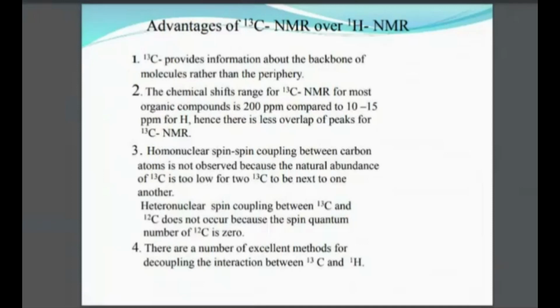So when I say overlap is rare, what factor of the graph has increased? Anybody? Can you guess the word? If there is no overlap, what is better? You can consider this with your HPLC signals. Yes, Pratiksha, brilliant. Pratiksha, you have better resolution.